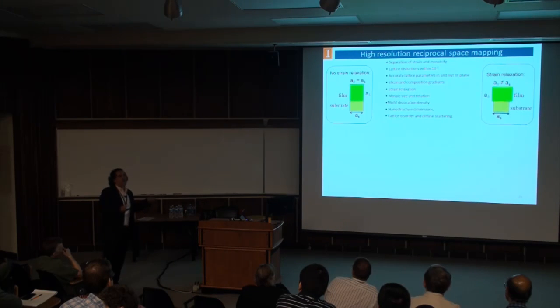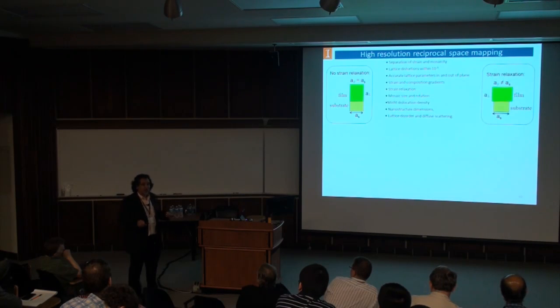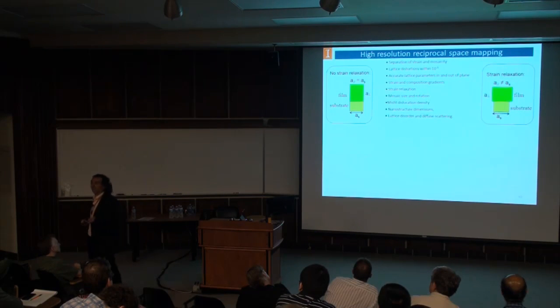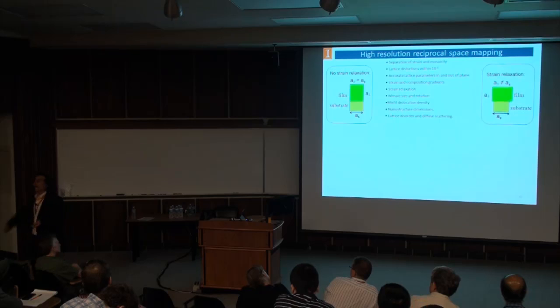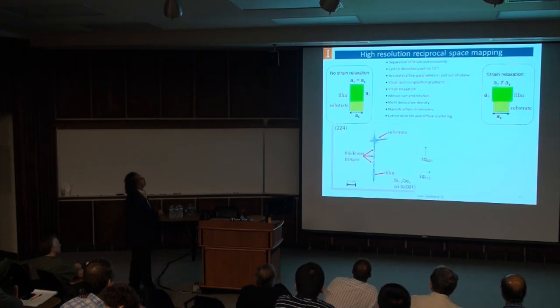You remember when I initially showed these dots of the reciprocal space? We're going to see how they look in real life. We're going to look at these dots now. The peaks that you see in the X-ray data are just a projection and integration of these dots. We're going to catch those dots right now and see how they look. So ready for that? Let's go. That's what reciprocal lattice mapping does.